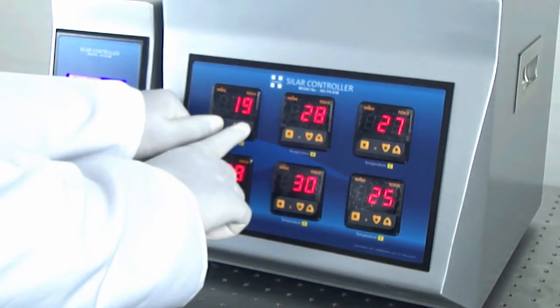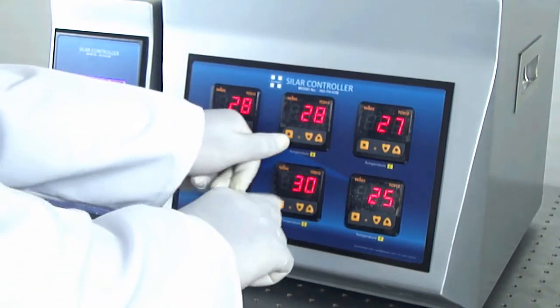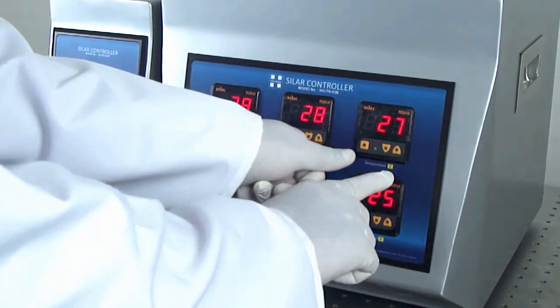The unit is also provided with six heating platforms with independent temperature controls. This enables us to set different temperatures for each of the six heating platforms.